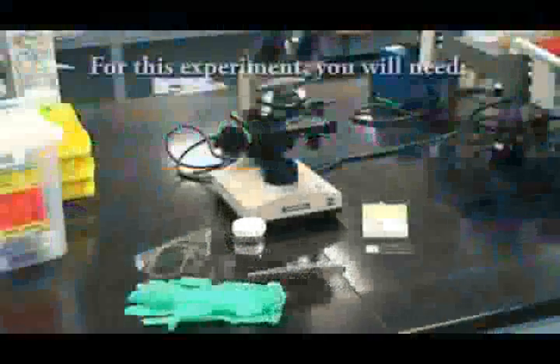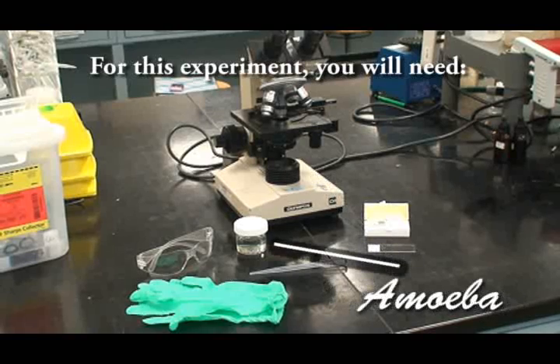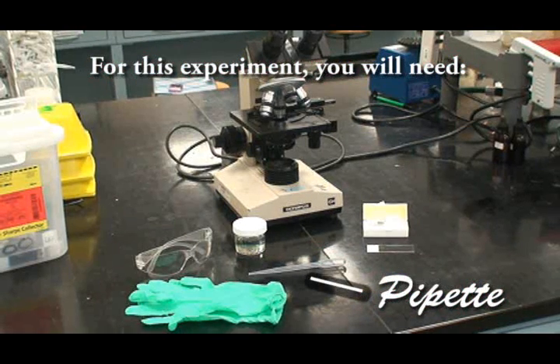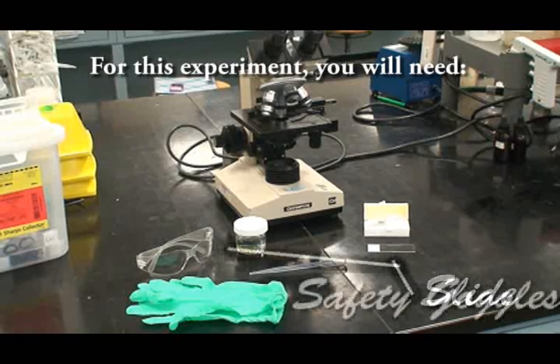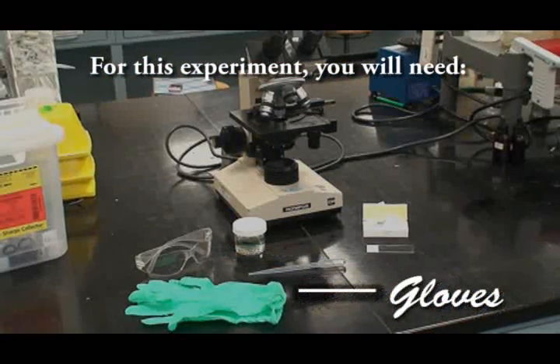For this experiment, you will need a microscope, amoeba, a pipette, a coverslip, a slide, safety goggles, and gloves.